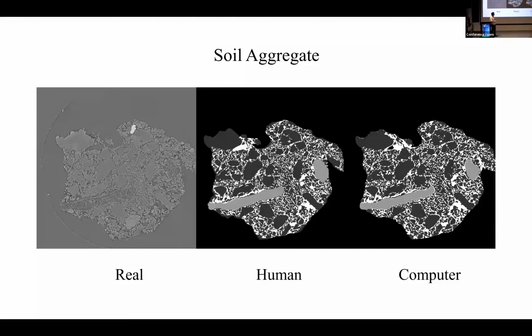This is what the computer thinks this aggregate should look like in my representation. And what we see is it does a pretty good job. It's a reasonable approximation of this mask. The biggest difference is it took me about 30 minutes to make this, and it took the computer about 2/100ths of a second to make that. So it's a lot faster than I am, which is nice.